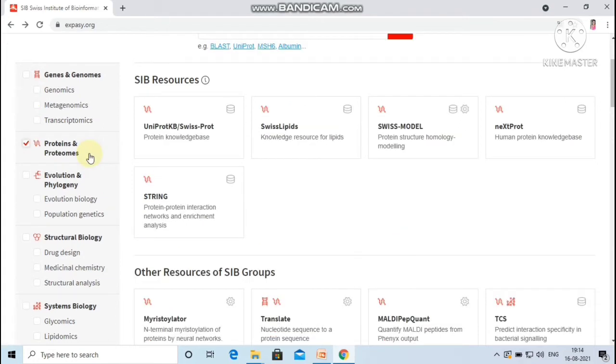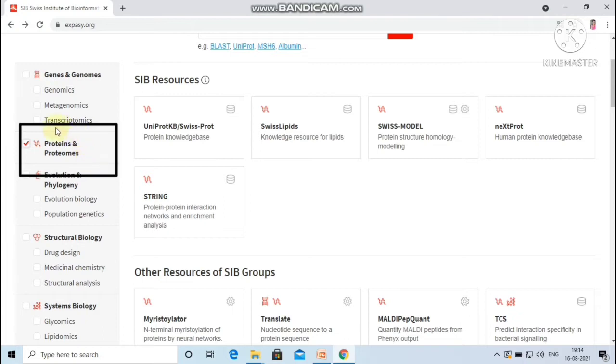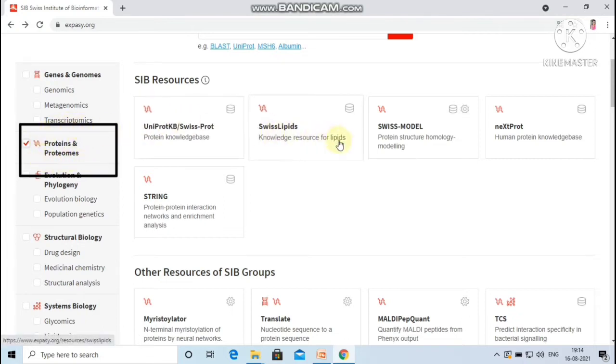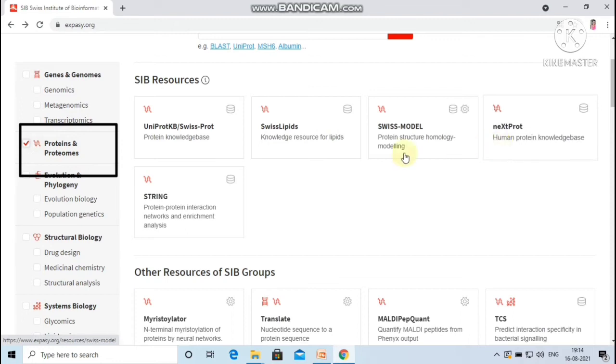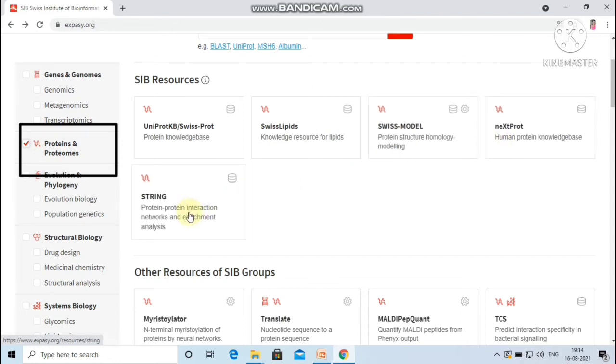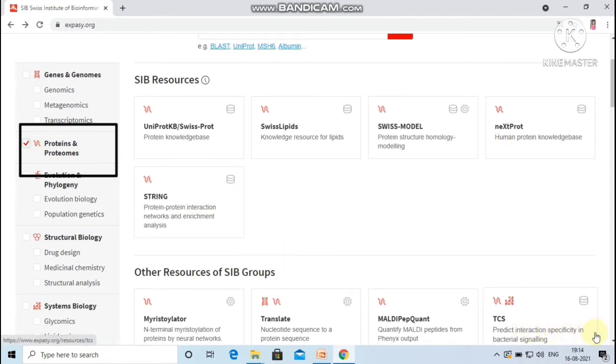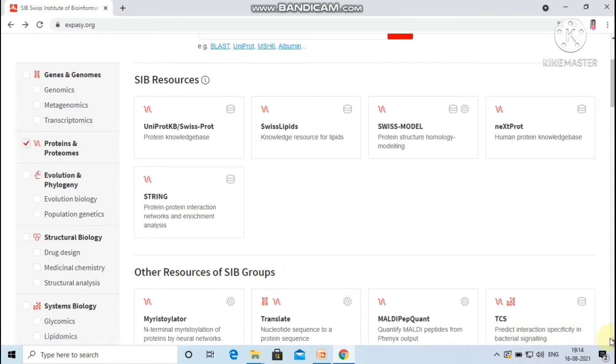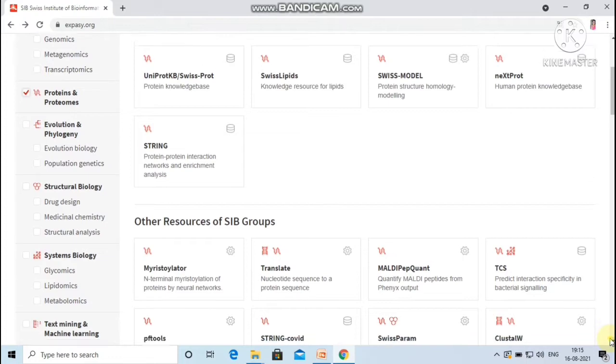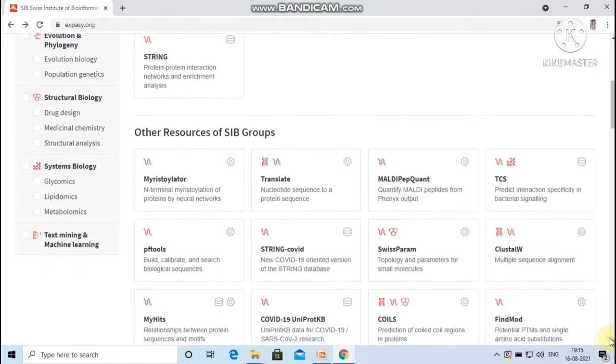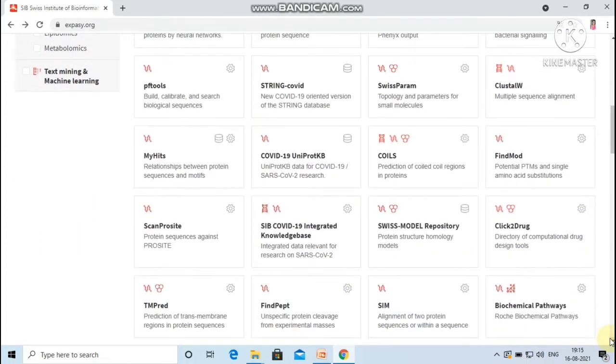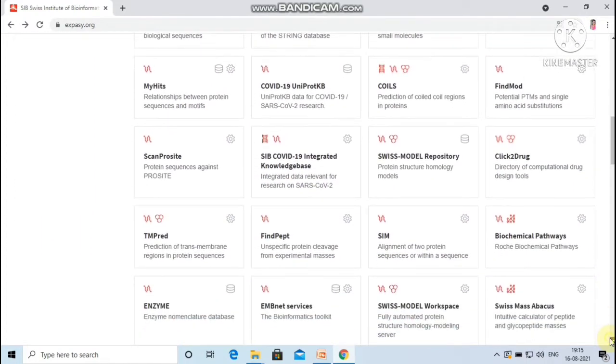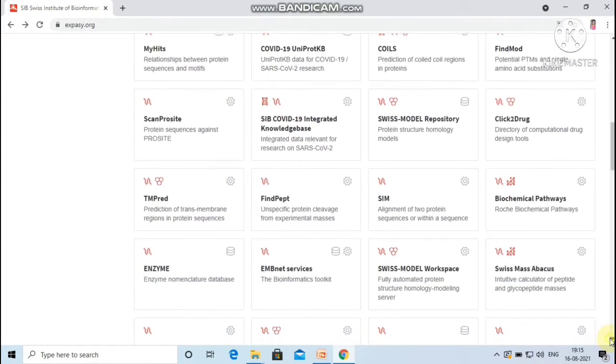Initially, it was called as Expert Protein Analysis System which acted as a proteomic server to analyze protein sequences and structures, and hence there are multiple resources under the category proteins and proteomes like UniProtKB, SwissLipids, Swiss Model, neXtProt, STRING, ClustalW, Translate, ScanProsite, ProtParam, TMpred, PeptideCutter, Compute pI/Mw, Prosite, etc.